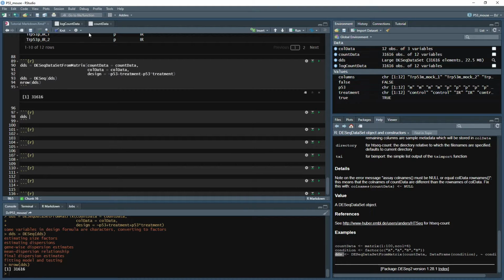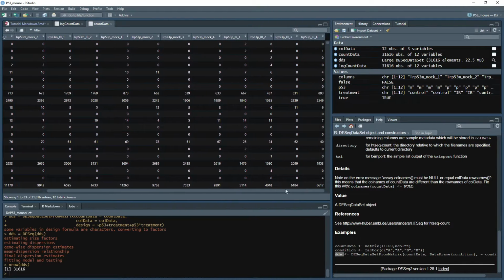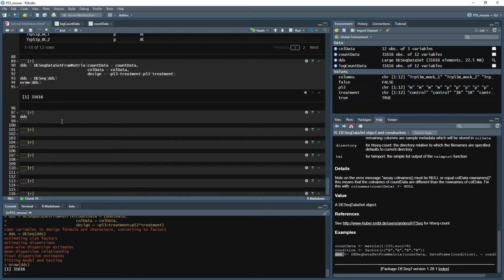So if a row has a count that's less than 3, we'll just take that row out, or we can do 5. So in this case, there's 5. If it's less than 5, this one would be kept, but in this case, this row would be gotten rid of. It'll just eliminate it, so we have 4 reps. If there's a 1 here, but the other ones have 0, it might not be that pertinent.